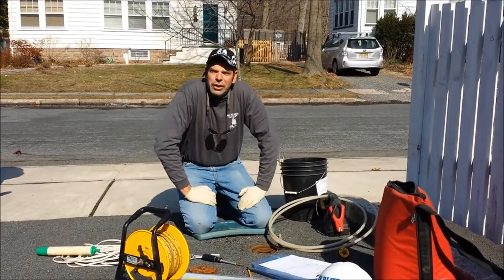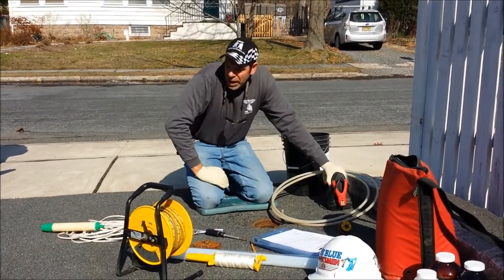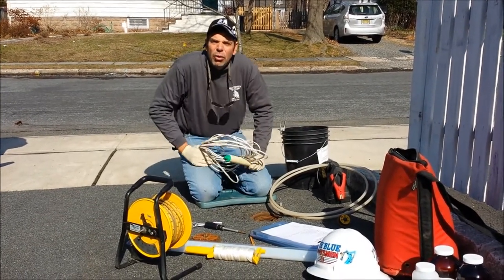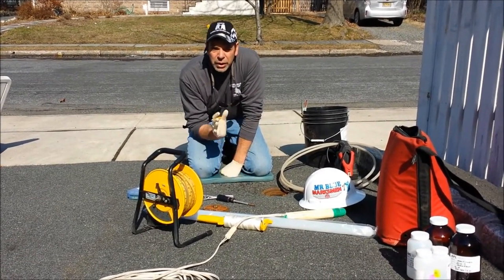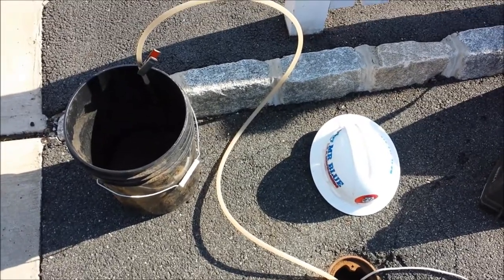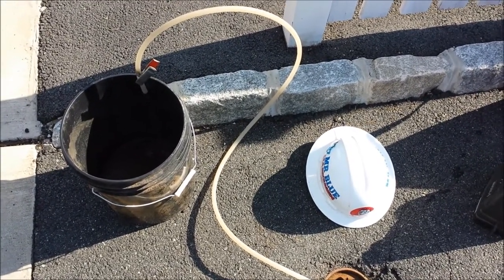Look at all this stuff we have to use just to collect the water level: water level indicator, disposable bailer, purge pump with battery, tubing — all of this goes into collecting one water sample. So we've collected our static water level measurement, we know the bottom of the well, and then we do a calculation to give us our three-volume purge. And here we are purging our well — we need to pull out about 2.29 gallons before we can collect the groundwater sample for the laboratory.